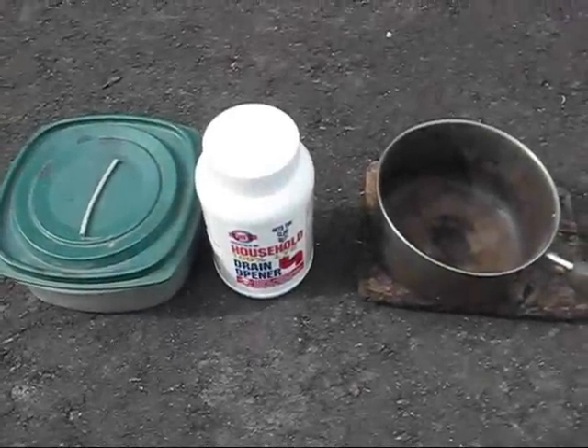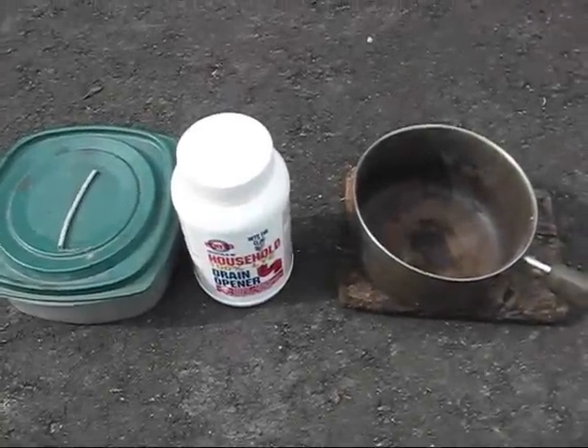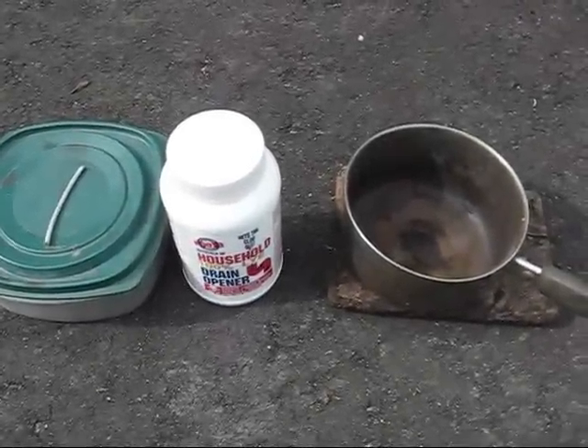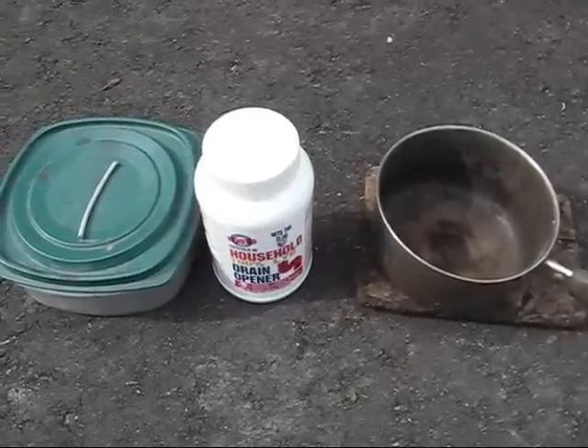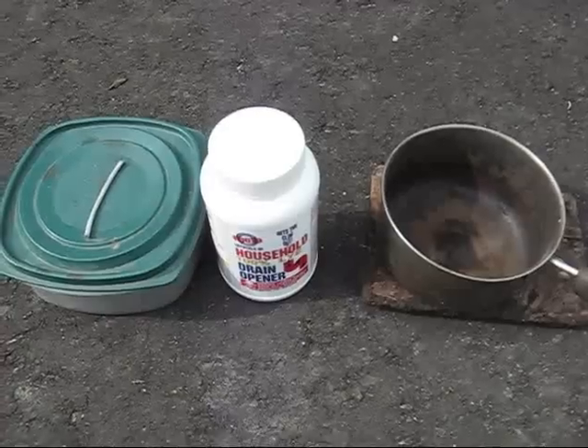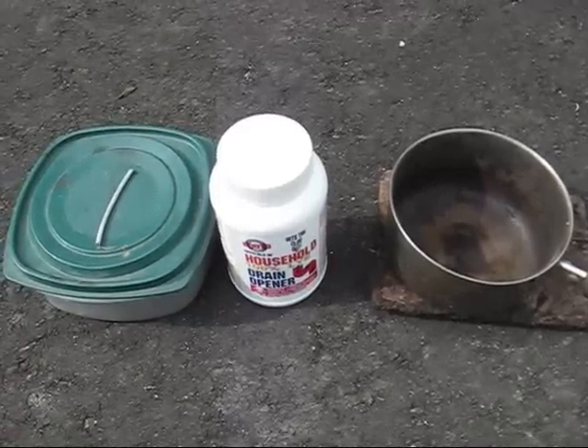Hey again guys. In this video I'm going to be synthesizing elemental sodium. This procedure requires the use of some very nasty chemicals and because of that I use latex gloves throughout the entire experiment. It should not be performed by an inexperienced chemist.